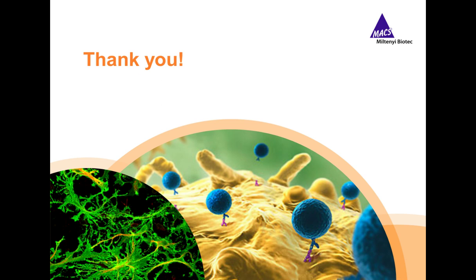Thank you. Can ACSA-2 antibody and GLAST stain astrocytes from old mouse brain? Excuse me, can you repeat? If they stain astrocytes in very old mouse brain, was the question? Yes, they can be used for staining of also very old mouse brain in case of brain sections. The expression of ACSA-2 and GLAST is not downregulated. At least we did not see a downregulation. And ACSA-2 can also be used for separation of astrocytes from old mouse brain in combination with the adult brain dissociation kit for dissociation.